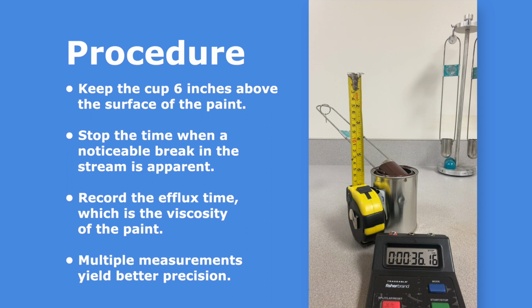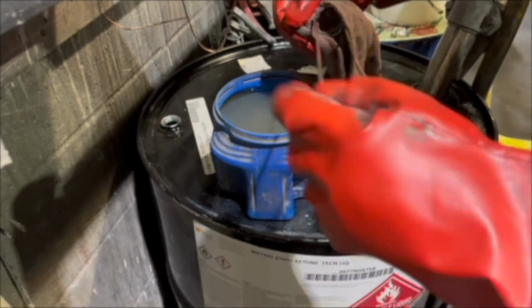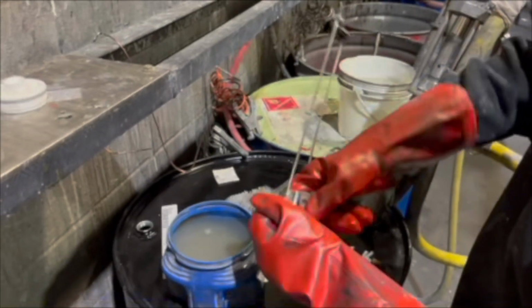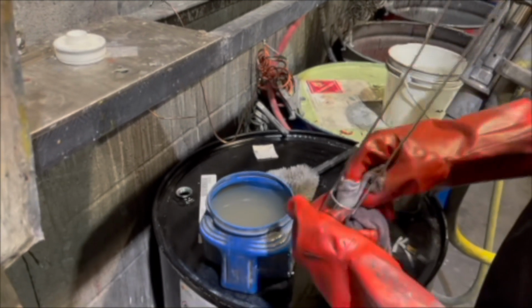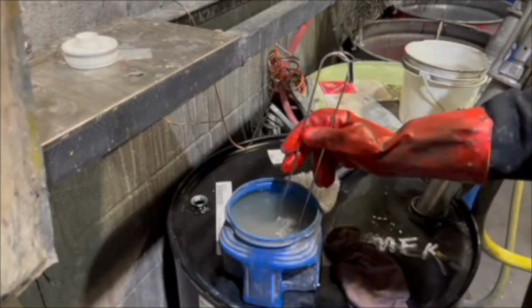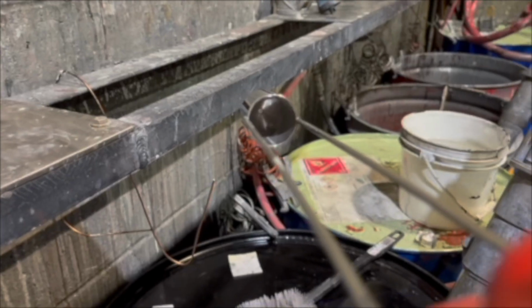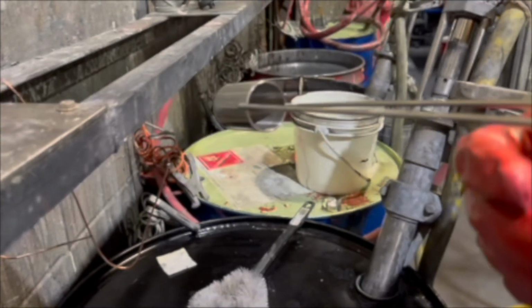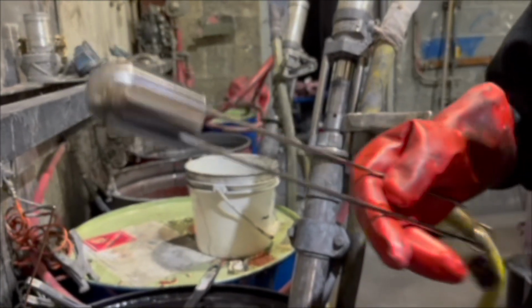It is common to make only a single measurement, but for greater precision, the mean of 2 or more measurements should be taken. Following each determination, clean the cup with a suitable solvent and a soft brush. Use no metal tools in contact with the instrument, as nicks or wear of the drilled orifice affect the accuracy of the cup. It's also very important that the cup is completely dry from cleaning solvents. Solvents attached to the interior wall of the Zahn Cup can affect the viscosity reading.